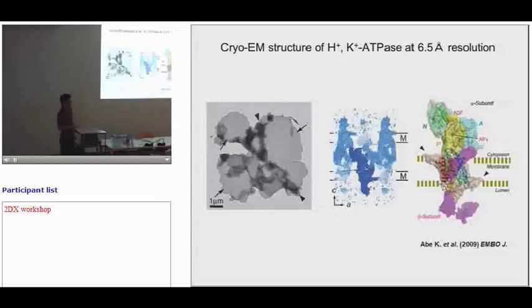The crystals are proven to consist of two membrane layers here. And in the 3D map here, 1, 2, 3 molecules are in the foreground, another 1, 2, 3 are in the background. And the protein has relatively large extramembranous domains, and the protein contacts are mainly mediated by the extramembranous domains.